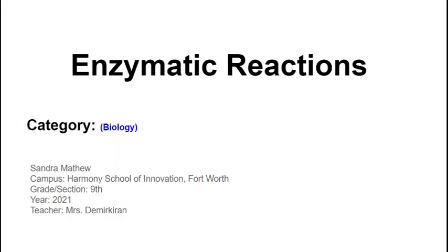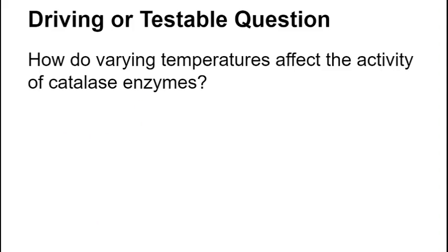In this project, I'll be talking about enzymatic reactions. My driving question for this was to test how changing the temperature of the substrate through the environment would affect the activity of catalase enzyme sourced from potatoes.